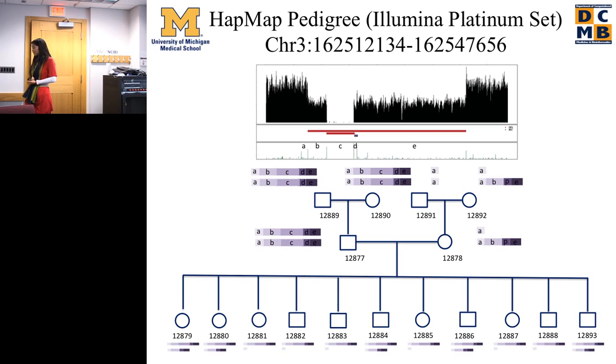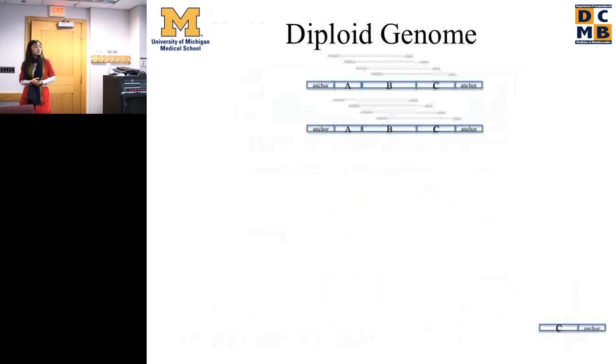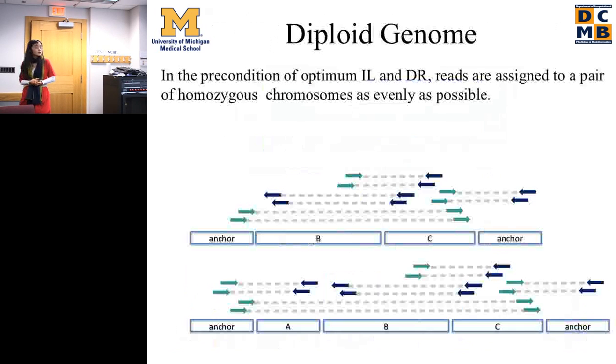Is the randomization completely randomized? Yes, completely. Because some of the reads give you some information on how the fragments are linked. Like the green one is just the anchor on the left, and the C fragment there is probably inverted. Yes, I know. There is definitely some hint from the reads we have, and also a very strong signal from the coverage. So when you do the randomization, you might consider that.